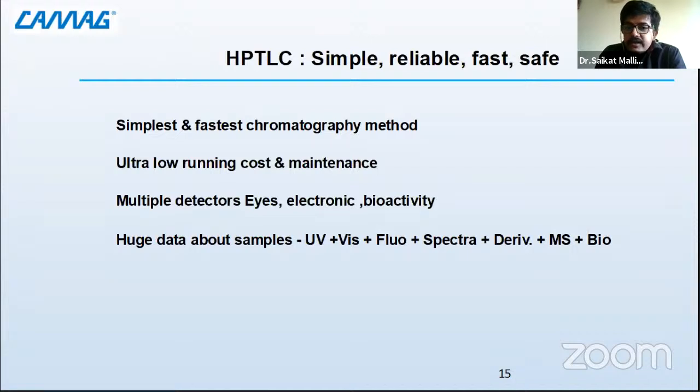And then multiple detectors, as I told you, you can view it with the eye, you get electronic data. And there is a third aspect of bioactivity where you can hyphenate this technique to a microbial culture, which is subjected to some antibacterial agent. That agent interacts with the molecule, and if the molecule is toxic for that bacteria, it becomes an antimicrobial activity. It will kill the bacteria or inhibit its growth, and that is by becoming antimicrobial in nature.